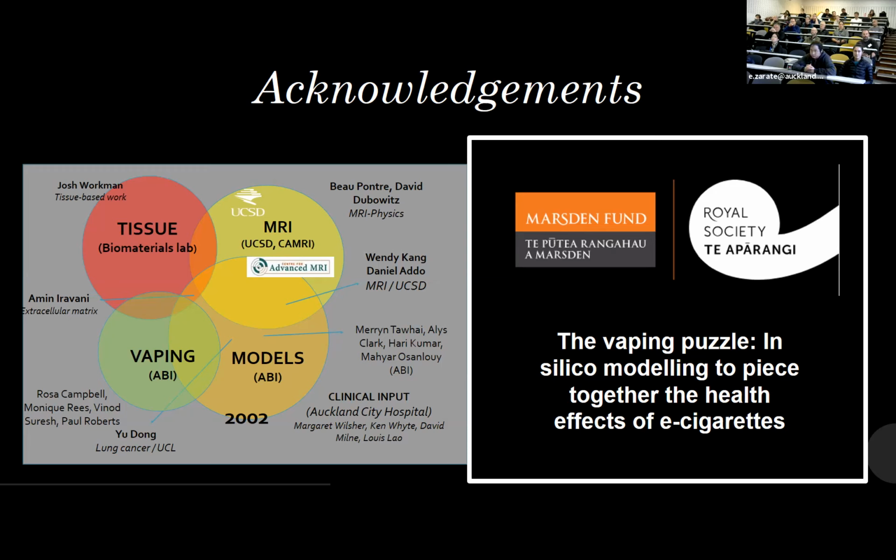So we need to talk to Udo here. He's the TDU person, so maybe he can give us some devices. We were thinking that when they are collecting the condensate samples, maybe having some of those cells to capture those chemicals and inject them straight into the TDU. But we can talk to him later and discuss it. This is a work in progress. Some studies haven't found formaldehyde, and I don't know if that's the methods they've used, or they're losing it, or sometimes maybe it's just not even created. But it would be nice to see some difference in the condensate at least.